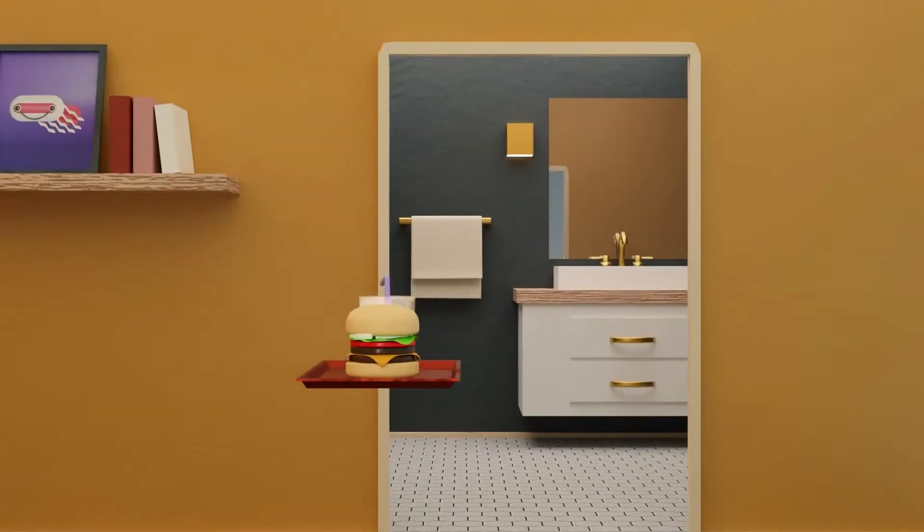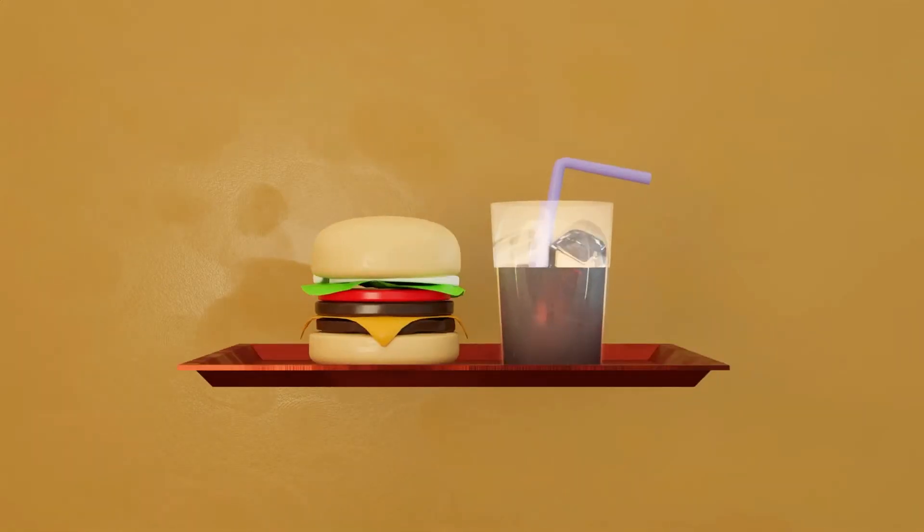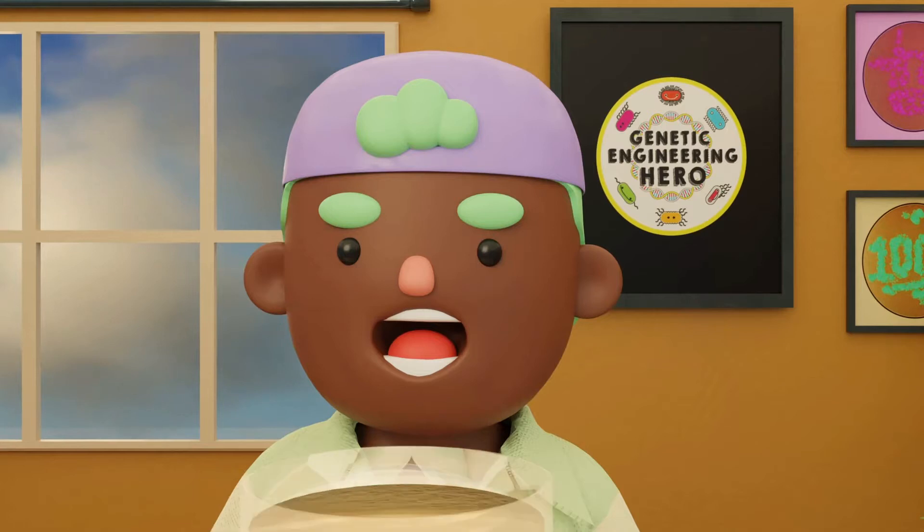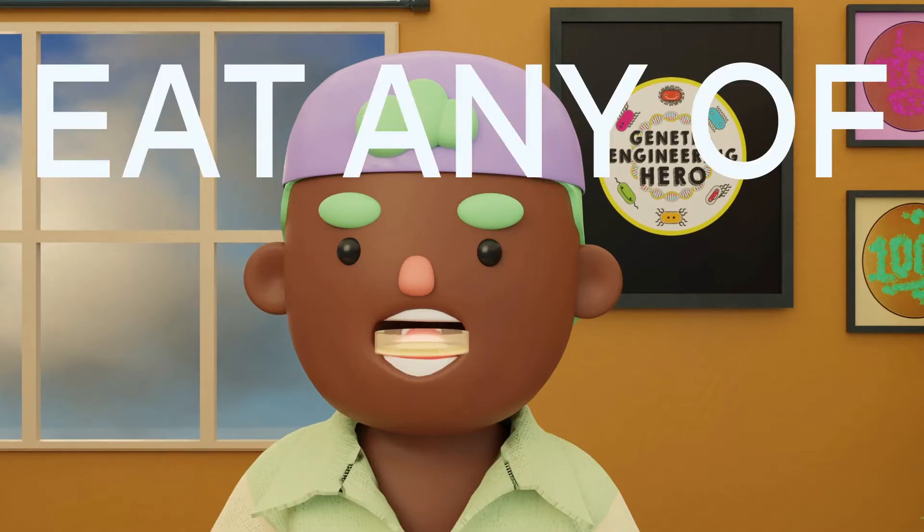Do not eat or drink near your experiments. Keep your experiment at least 10 feet away from any food or drink. Under no circumstances should you eat any of the kit's contents.